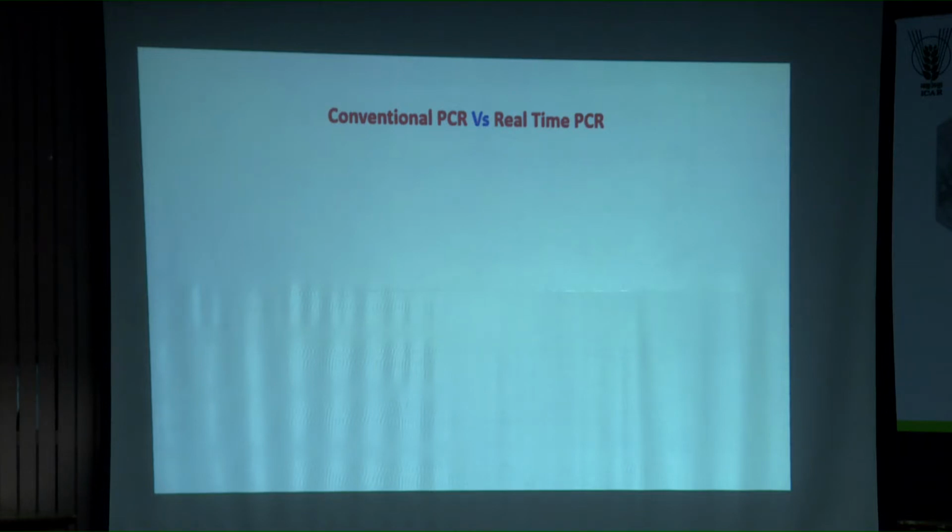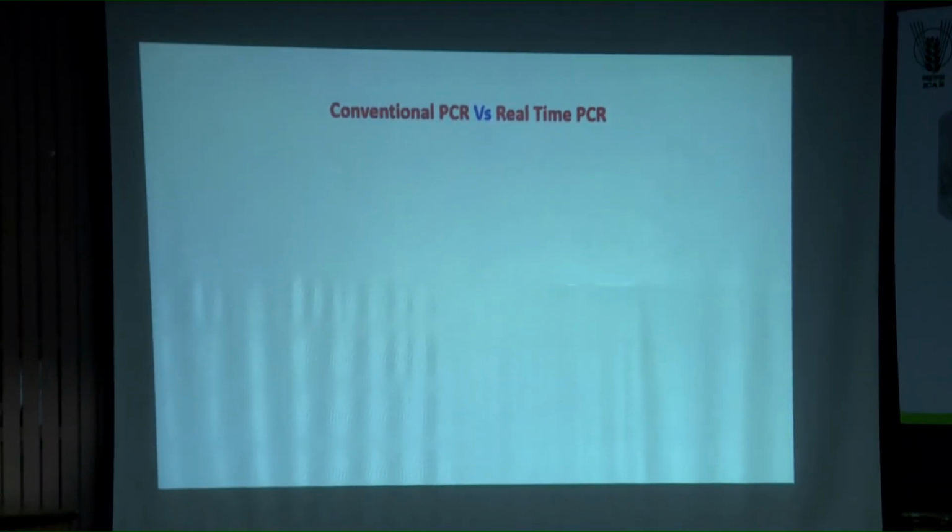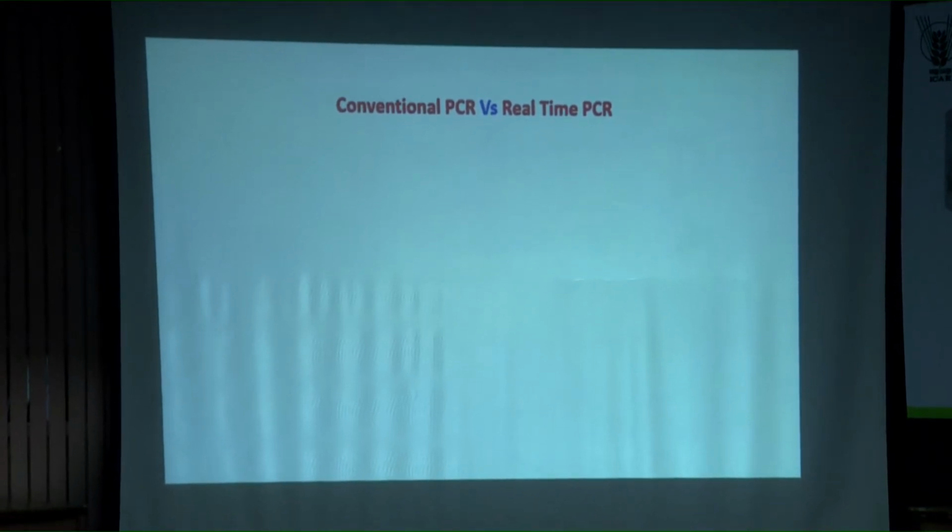That is all about a little bit of introduction and also the historical background about qPCR. Let us take a small discussion on the differences between the normal PCR and qPCR. Hereafter, I would call this normal PCR a conventional PCR, and the qPCR.